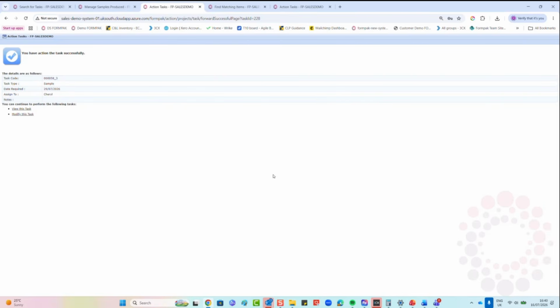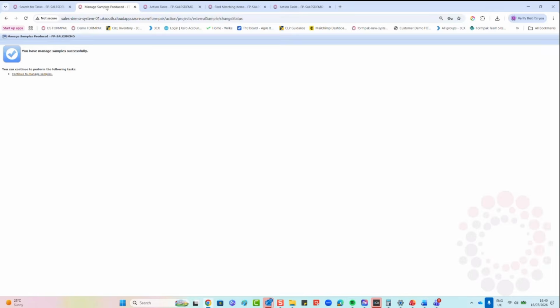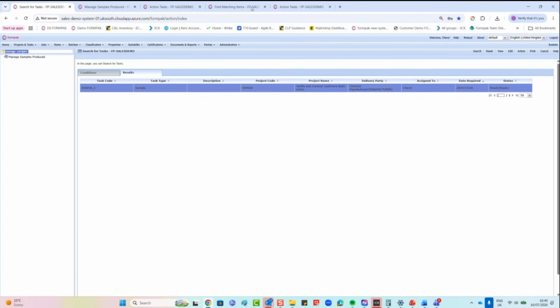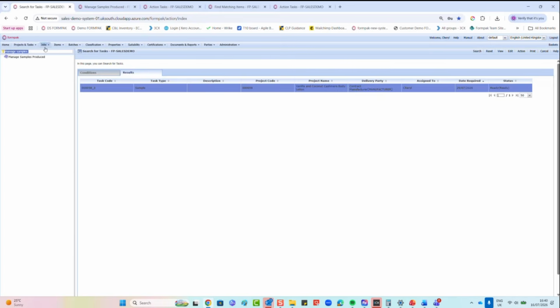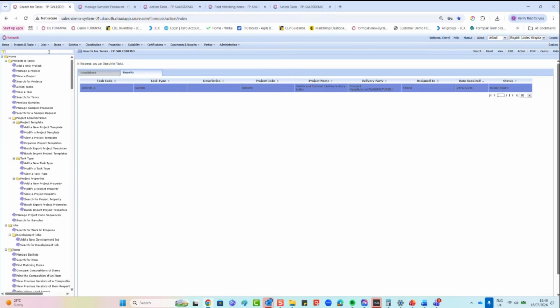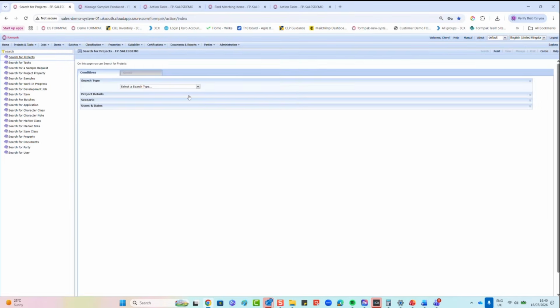Okay. So now the samples have been sent, all the tasks have been completed, and we just need to change the status of the project. So if we go into complete our project, if we have a look for our project, where have I put it? Search for it.